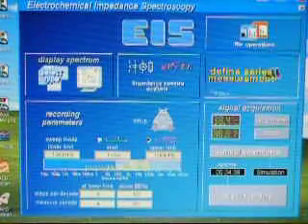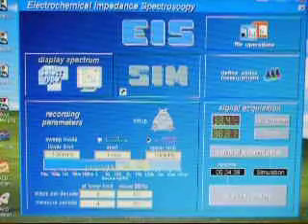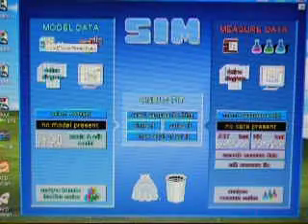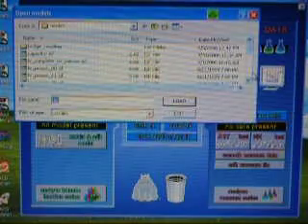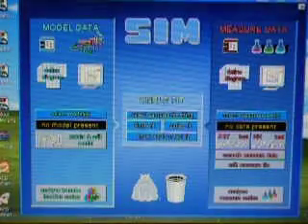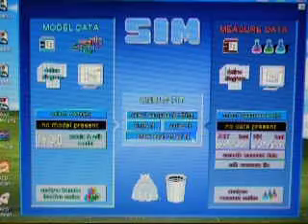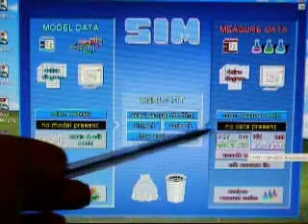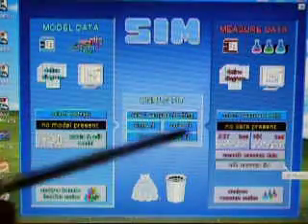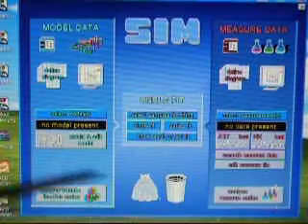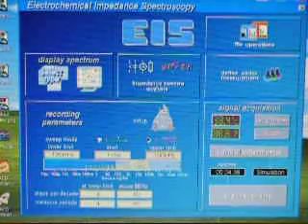That's the EIS data acquisition. This is the simulation, equivalent circuit fitting and modeling module that's included with every software package. We can acquire model data and open a model. We can fit the data — a single fit or series fits. This is the Z-HIT, or the Kramers-Kronig algorithm, which allows us to ensure the data is linear. We can acquire data as a series and then measure and analyze it as a series, including transfer function series. And that'll be the end of this demo — thank you very much.